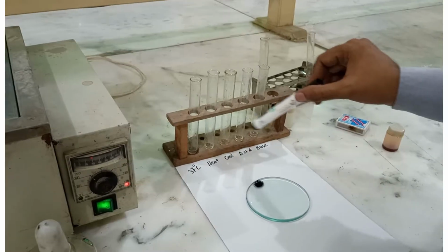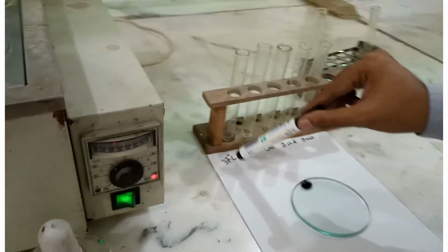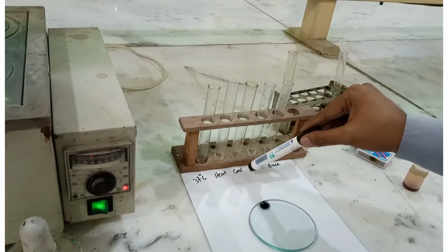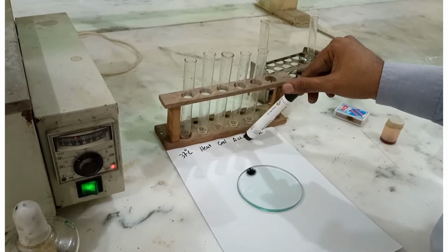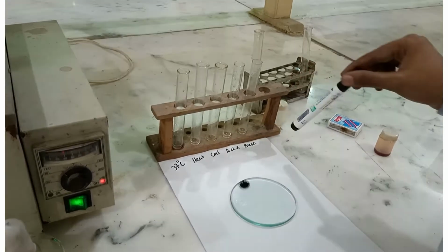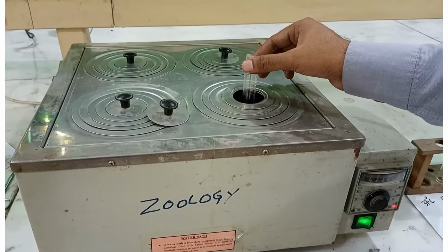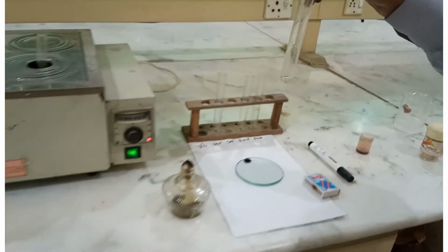We have added an equal amount of salivary solution in all the 5 test tubes. Now we are going to put the first test tube at 37 degrees centigrade, the second tube we have to heat on flame, the third tube we will cool in the freezer, the fourth one we have to treat with acid, and in the fifth tube we'll add the basic solution. The first test tube is going to 37 degrees centigrade for 10 to 15 minutes in the water bath. We have to keep this tube in the refrigerator for cooling.